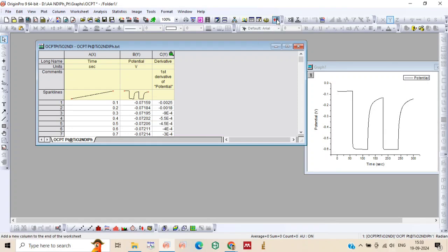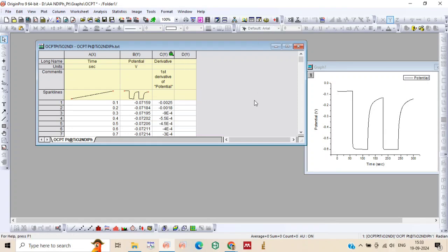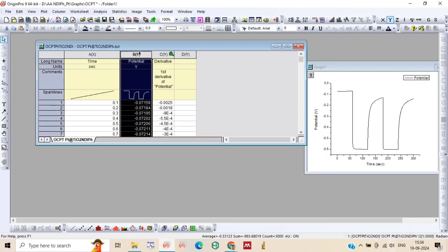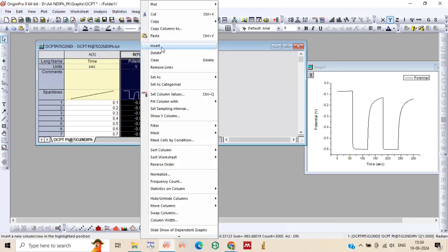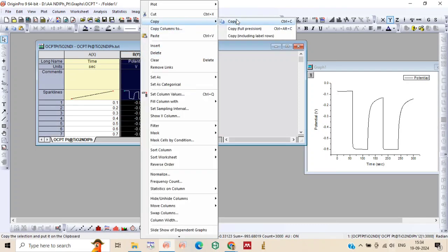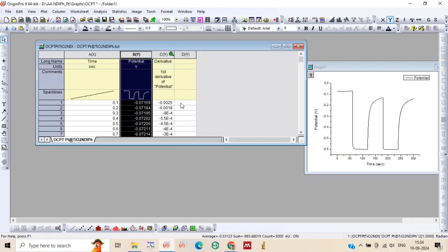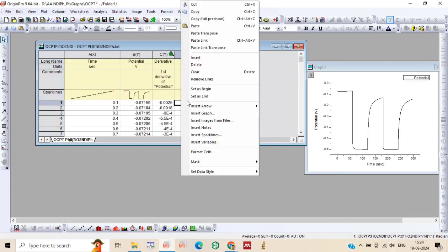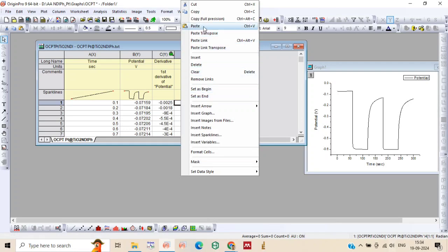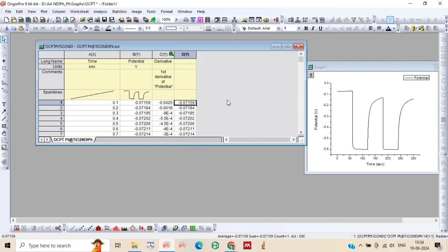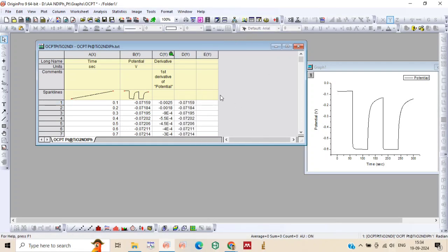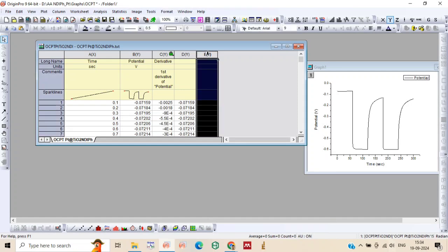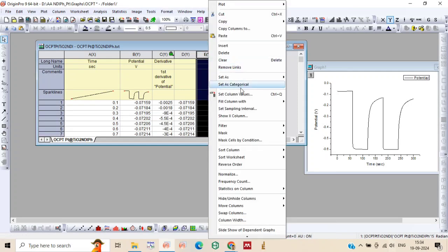Now just add one column. Copy column B to column C. And add one more column here.